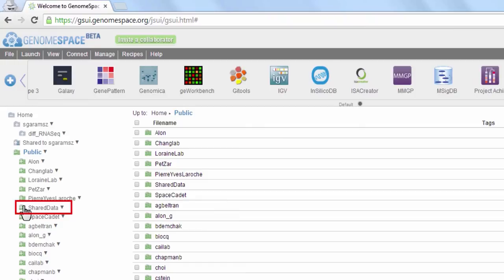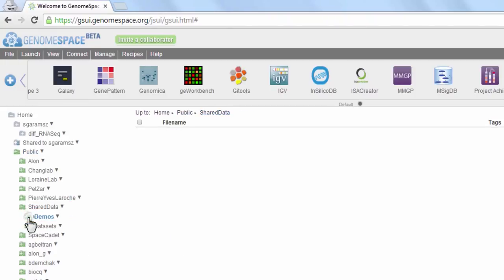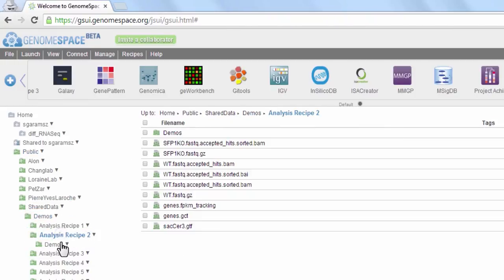From the public folder, make your way to shared data, demos, and finally analysis recipe 2.